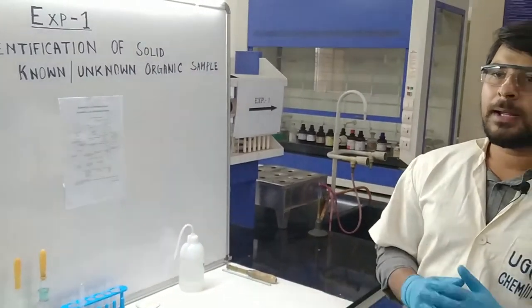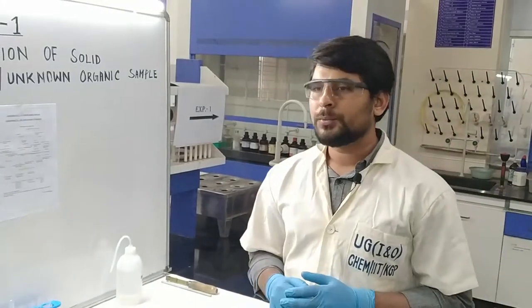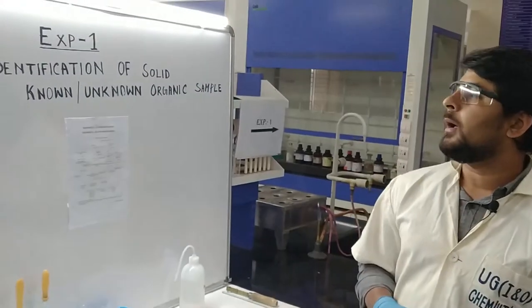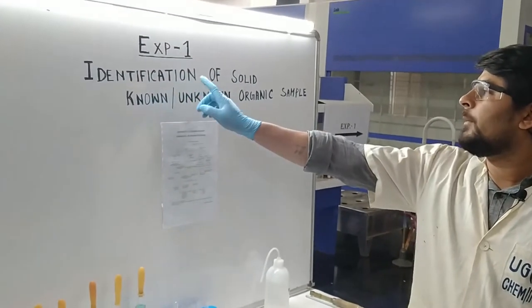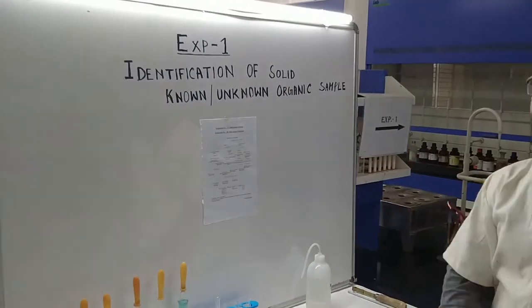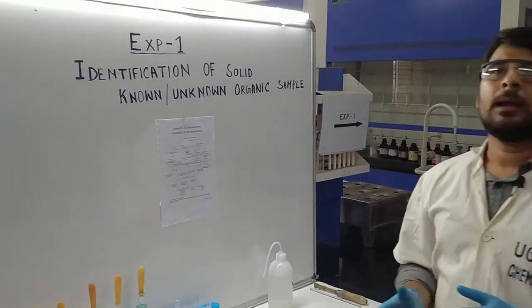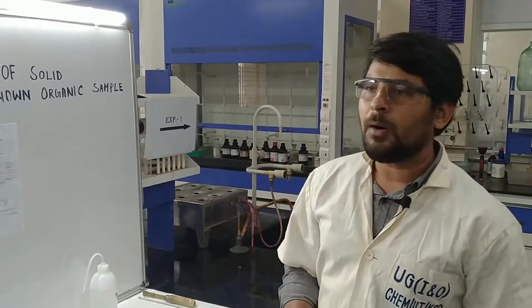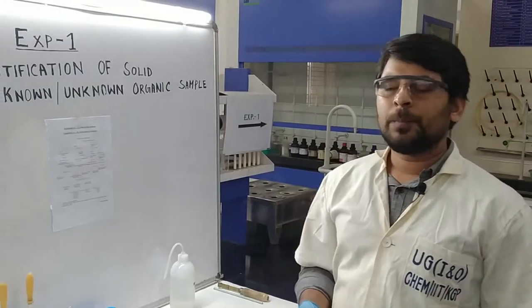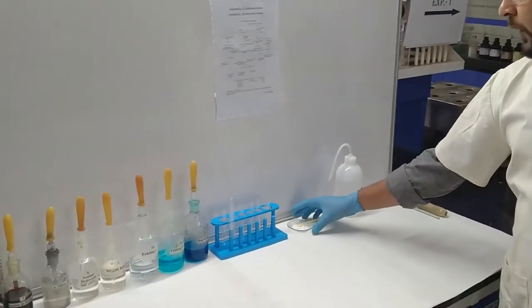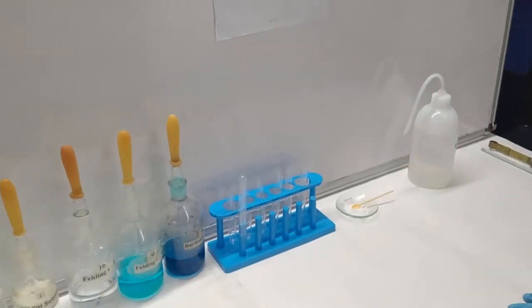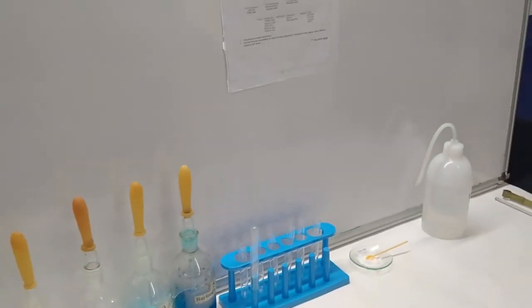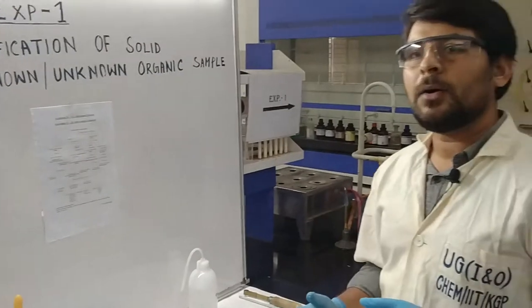Hello students, this is the organic lab and I am going to show you an experiment today - experiment number 1, which is identification of a solid known or unknown organic sample. Generally we do lots of samples during lab time, and today I am going to do a sample that is glucose. I already took some solid glucose, and to start, first we have to perform a preliminary test and then a confirmatory test.